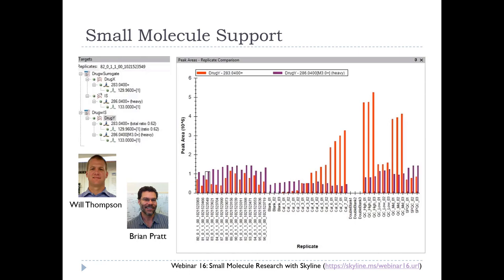You can do mixed experiments with both peptides and small molecules, and people actually use this small molecule support, which I've been saying we should call all molecules. People use it for cross-linked peptides. So things that are hard to define in the way Skyline natively defines peptides, even if they end up being peptide molecules, can be defined in this sort of generalized molecule support.